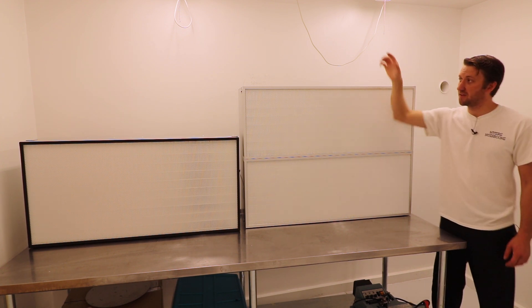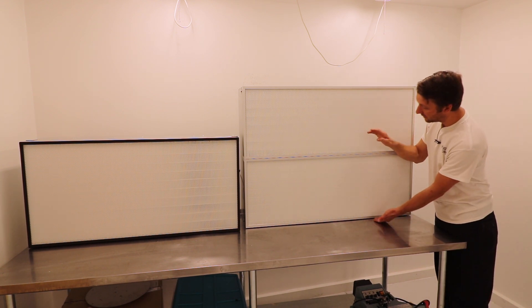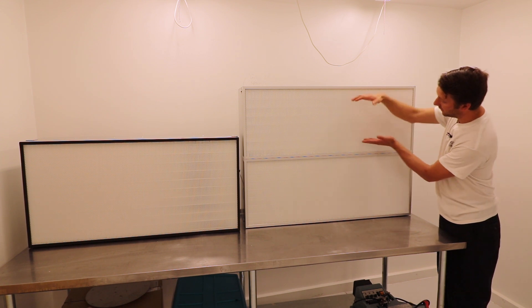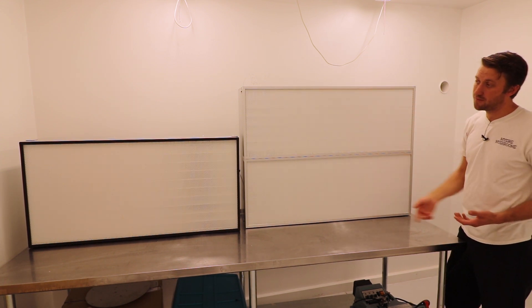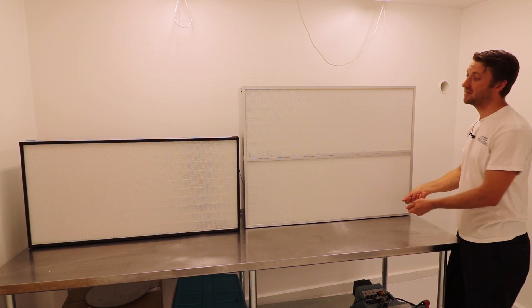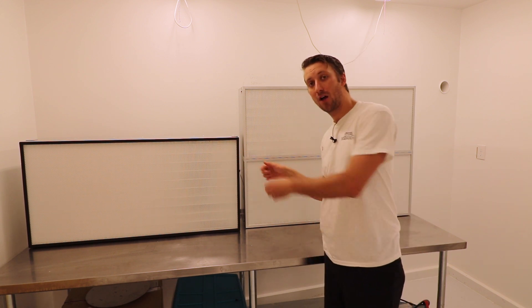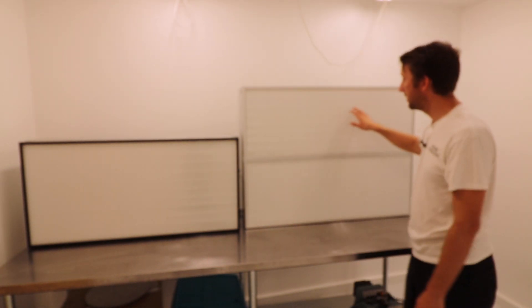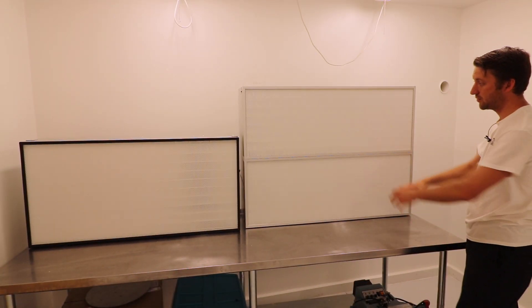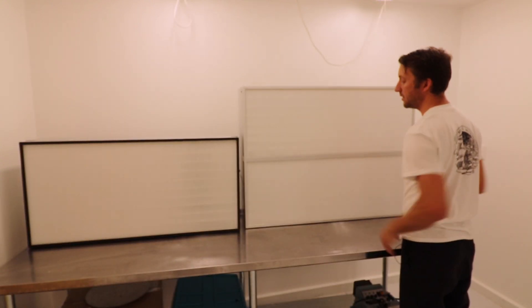I'm selling the 2x4 and also this 3x4. The 3x4 puts your XLS bags right around here, giving you all this space up top to work in. Those of you with a two-foot flow hood know that when you open XLS bags they're right at the top, so when you come in with a petri dish you're in that danger zone of non-clean airflow. The 3x4 gives you that extra freedom of movement to lift things up higher.